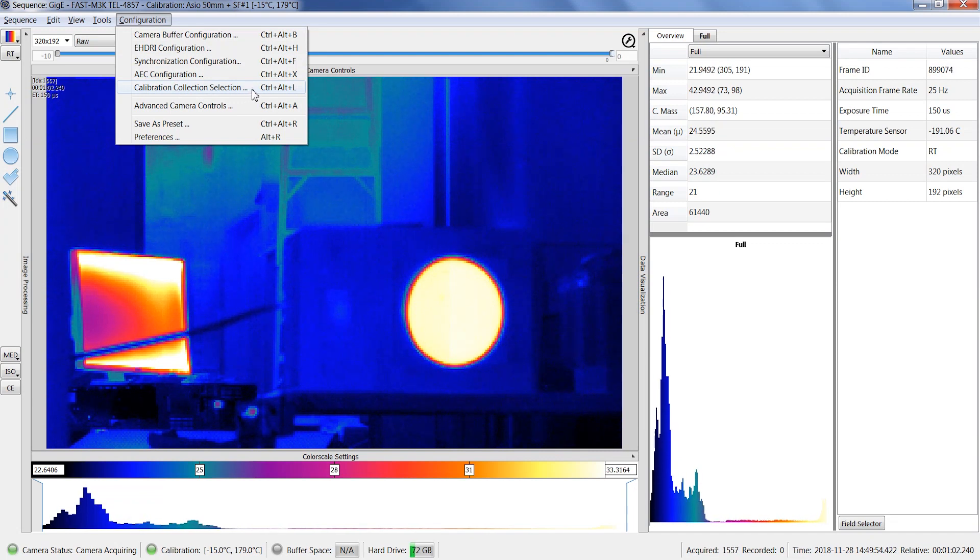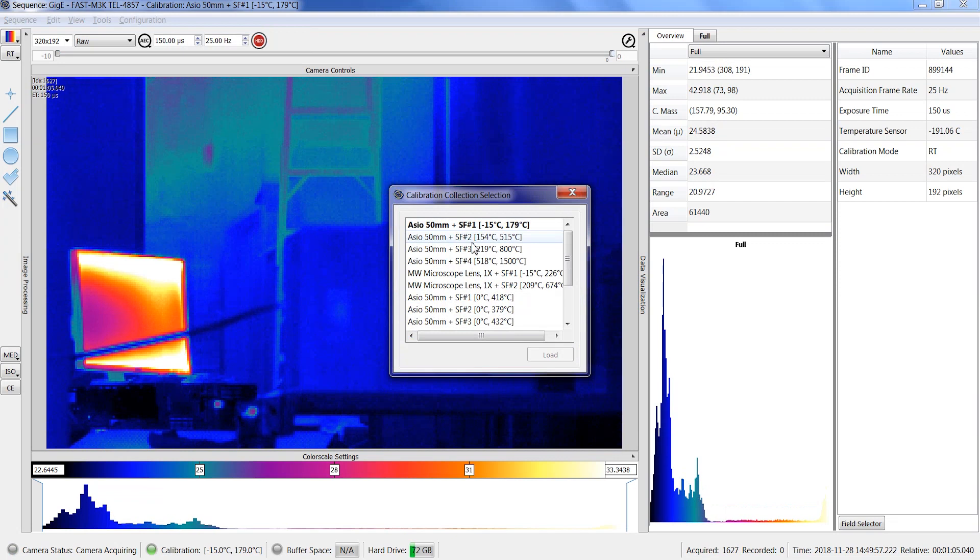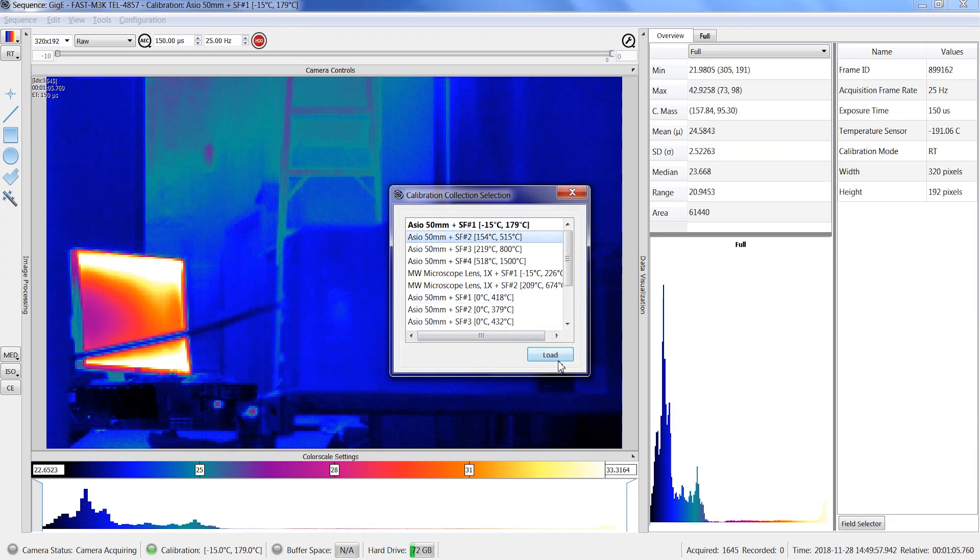If you need to change the calibration, you don't need to close the sequence window and go back in the main window as another calibration can be selected from here.